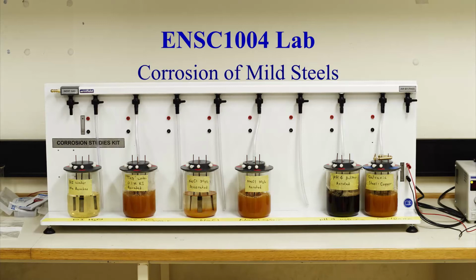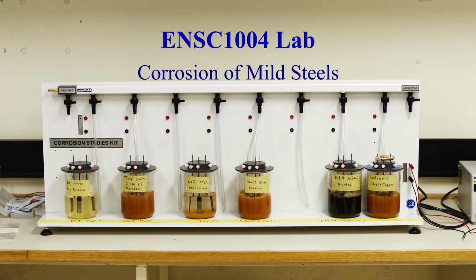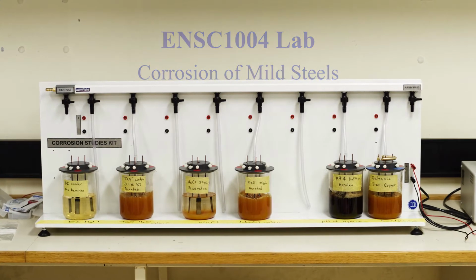Hello, and welcome to the ENSC 1004 Corrosion Lab. In this lab, we will focus on the corrosion of mild steel in a number of corrosive environments.